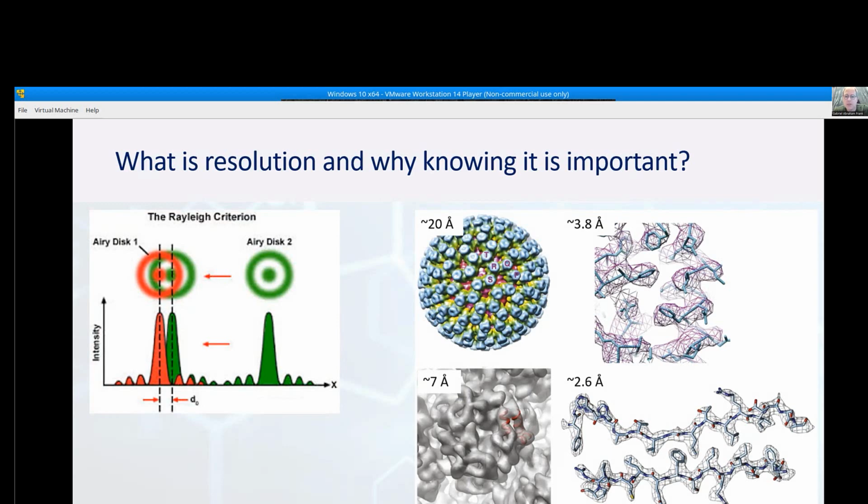So the common practice in the field is to try to assess the resolution and then filter the data to delete the high resolution terms from the data. And that is done with a set of preset and very well known image filtering tools. However, if I overclaim my resolution, I would filter to a higher resolution, which means that pieces of noise will stay in the data, and then I can commonly claim that I can see, let's say, some kind of an ion that is bound to the protein. That is actually very important because these structures are, from one side, the strongest drivers for interpretation of biochemical phenomena and for the different assumptions about biochemical systems and how they behave. On the other side, from the point of view of industry, these are crucial in order to understand what is the next step in the development of a new drug.